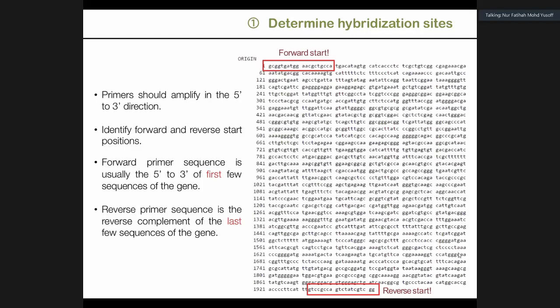It's very difficult. So we just looked at the conserved region first. Once we got the sequence in the middle, we targeted the upstream and downstream regions by doing walking PCR. So we design side by side, region by region.